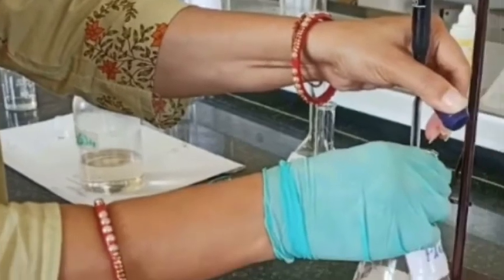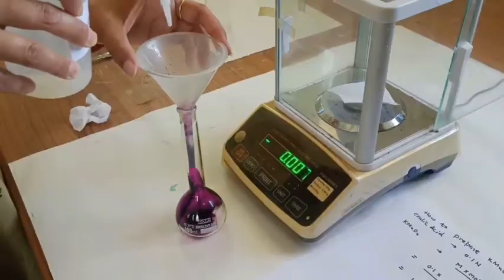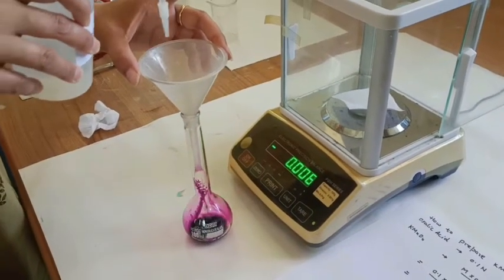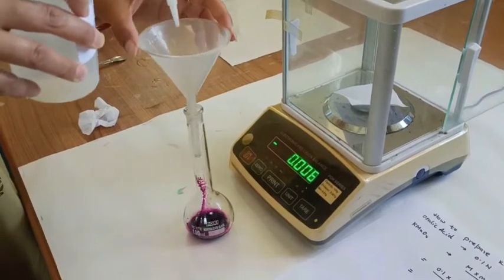So here I am showing you the reaction of KMnO4 versus oxalic acid, in which KMnO4 works as an oxidizing agent and itself gets reduced by producing nascent oxygen, whereas this nascent oxygen reacts with the oxalic acid, and oxalic acid converts to CO2 gas and gets oxidized. Here I am preparing the KMnO4 solution. I have taken some weight of KMnO4.